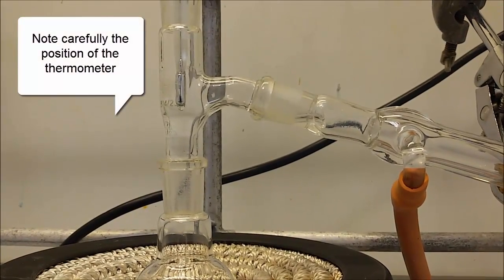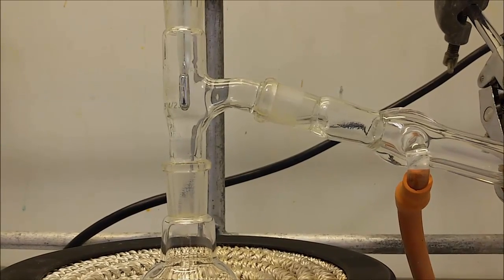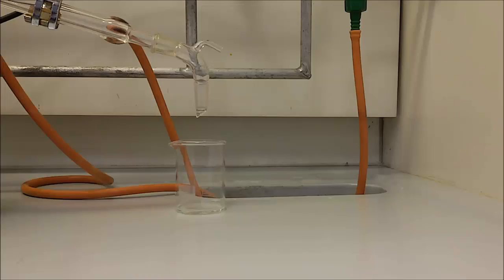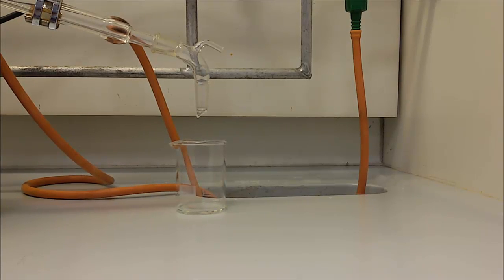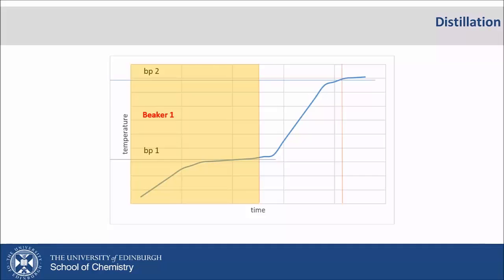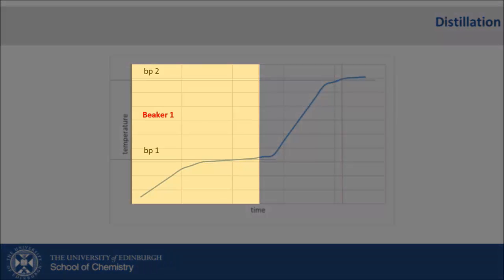You can see how the vapors are condensing on the upper parts of the setup. And the vapors that enter the condenser condense into the beaker. This is the first component of the mixture. The temperature rises and then reaches the boiling point of it.